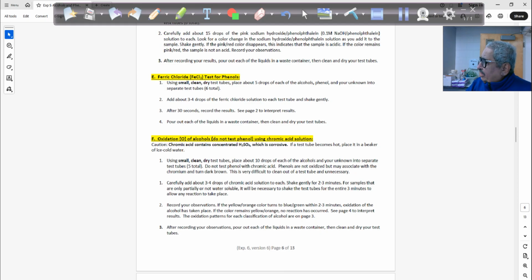The primary, secondary, and tertiary alcohols combust easily. They give you CO2 and H2O. But phenols burned inside the flame in the presence of oxygen give, besides CO2 and H2O, a lot of soot. A lot of dark carbon particles are not converted into carbon dioxide. Are you following me here?